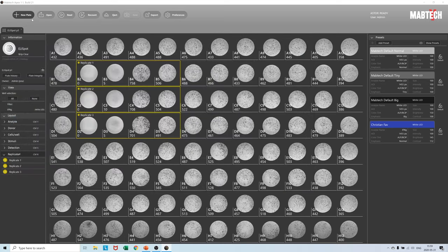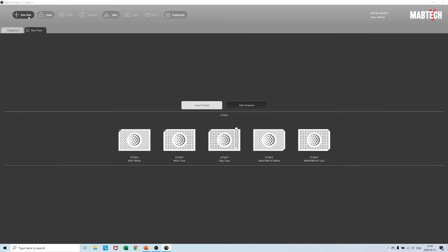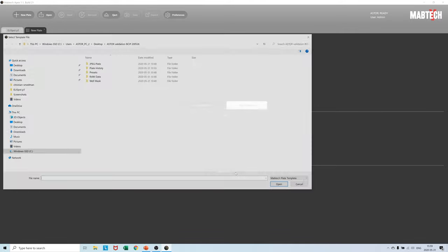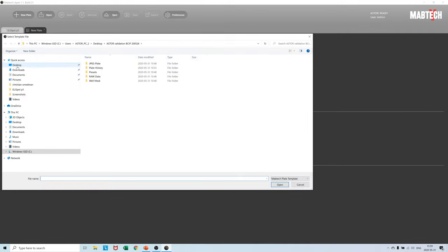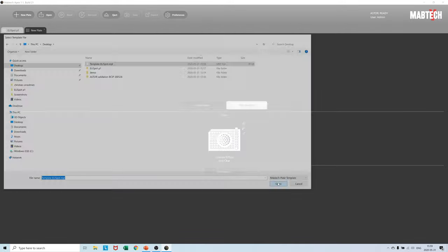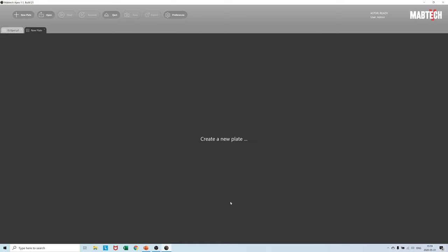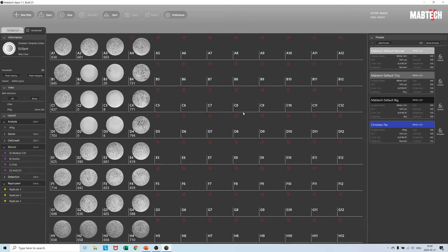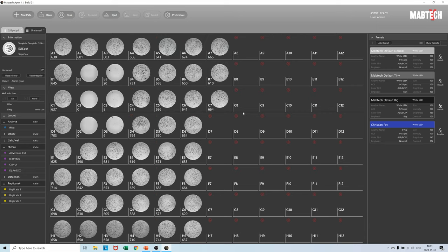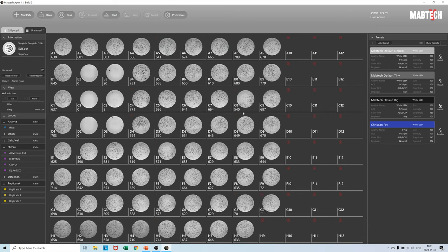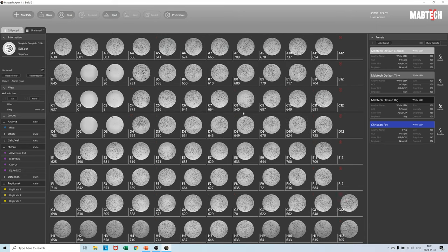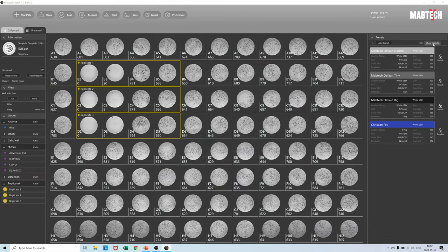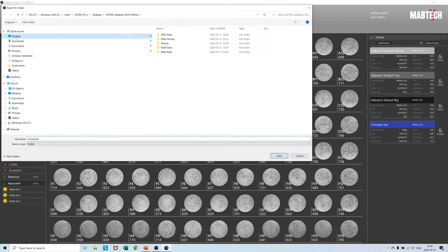We now want to analyze plate number 2 and we can do this by easily loading in the template file from the desktop. As a result the layout labels and the presets are carried over to plate number 2 automatically and all we need to do is press the read button after inserting it into the Astar. One minute and 45 seconds later we are done and the plate can be saved on the desktop as Elispot P2.